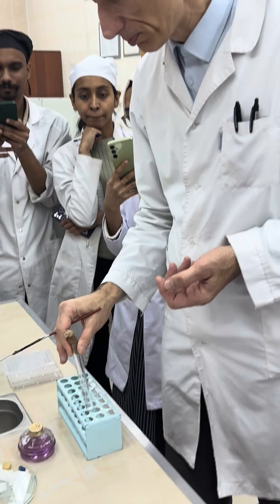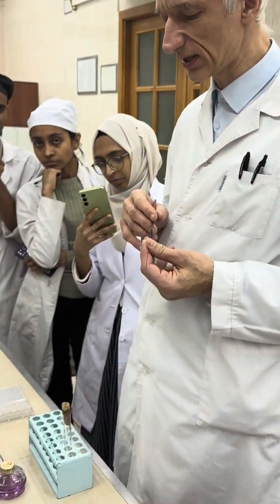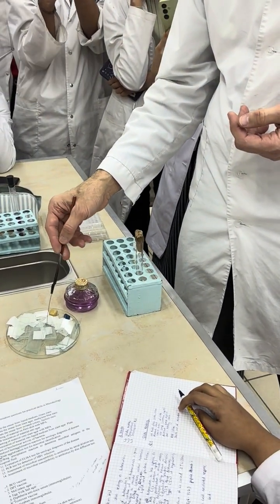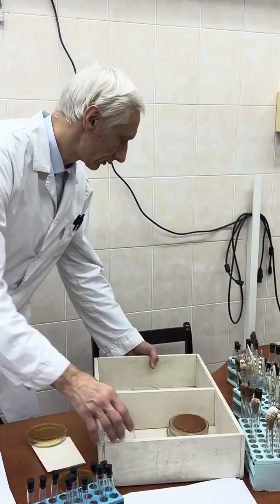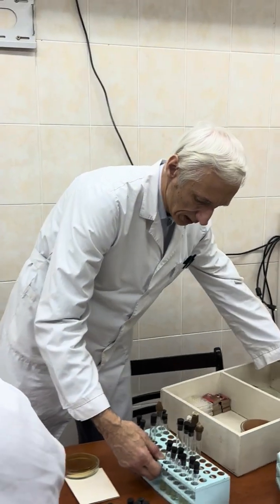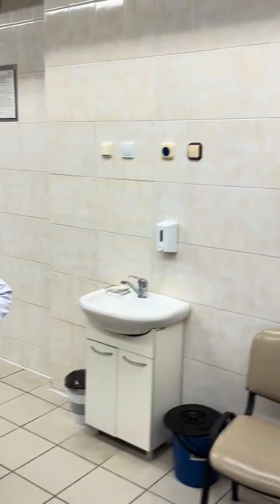Put it inside, and you put the drop of saline. Pay attention that for the slide, there is no need to spread the drop through the whole oval. The whole drop should be in the oval. Then I'll show you one more typical mistake, visible here. So now the slant. For example, this one, why not?